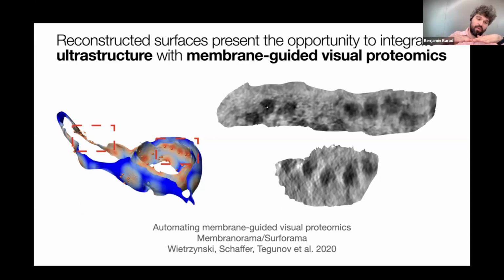And what's cool about that is you can now step up and you can be at a set distance from the membrane and see all of the membrane proteins at that distance from the membrane pop into view. And this is a really powerful way to sort of gain insight into where proteins are to make it easier to pick particles. And you get a lot of pre-orientation information because most proteins, they're sticking straight down into the membrane. So you actually gain all but the in-plane rotation angle just from the way you pick the particle.